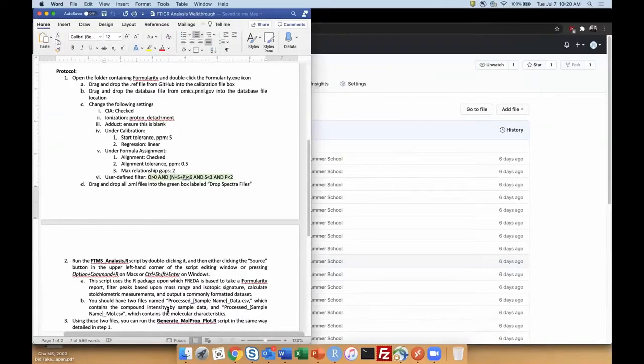Yeah, so that's the problem, is that one of the samples was not calibrating correctly. What I'd recommend doing, just to make sure everything works correctly, is simply select the Altamaha River samples. So the six samples that begin with Altamaha, and then drag and drop those onto the box instead of using all of the data. That would be the simplest approach, rather than trying to troubleshoot it like I just did. But know that the log does contain information whether you can or cannot troubleshoot it.